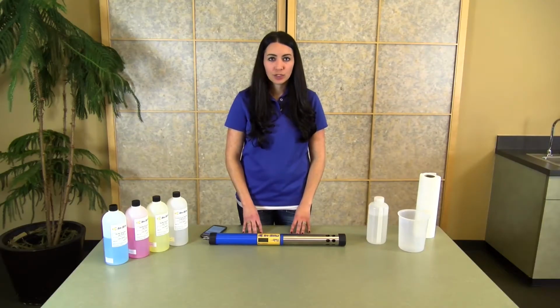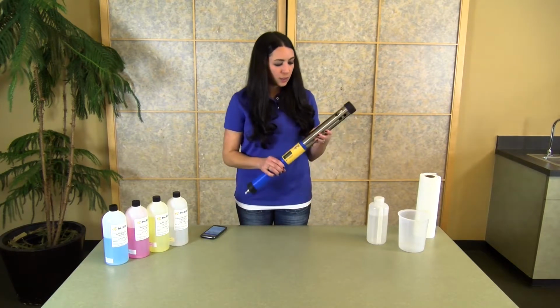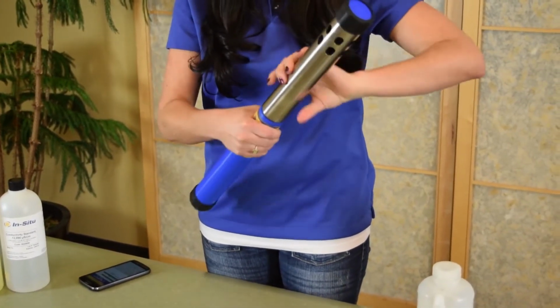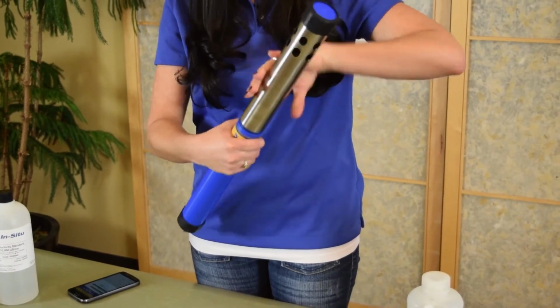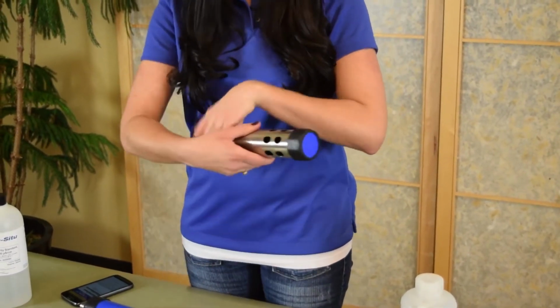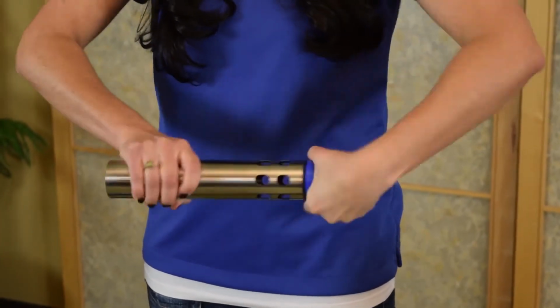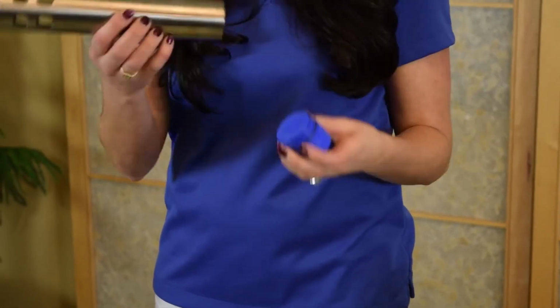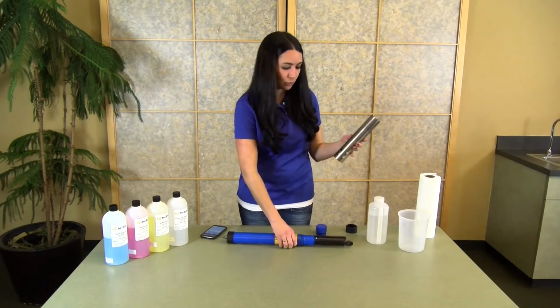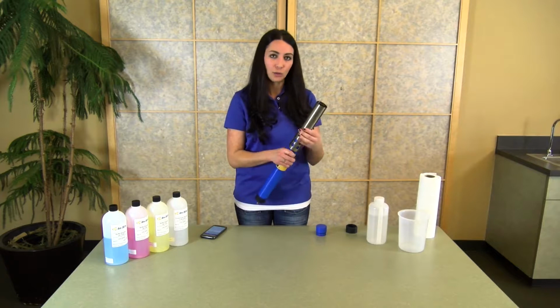To begin your calibration, you want to make sure that the instrument is set up in calibration mode. So one of the unique things we did on this was actually provide a dual-sided restrictor that allows you to deploy the instrument but also perform your calibrations directly with the restrictor. So to put the instrument in calibration mode, you'll remove the restrictor, remove your bottom end cap, unscrew the end cap, and actually flip the entire restrictor around. So as soon as you have your restrictor this way and inserted onto the instrument, you've created your calibration chamber.